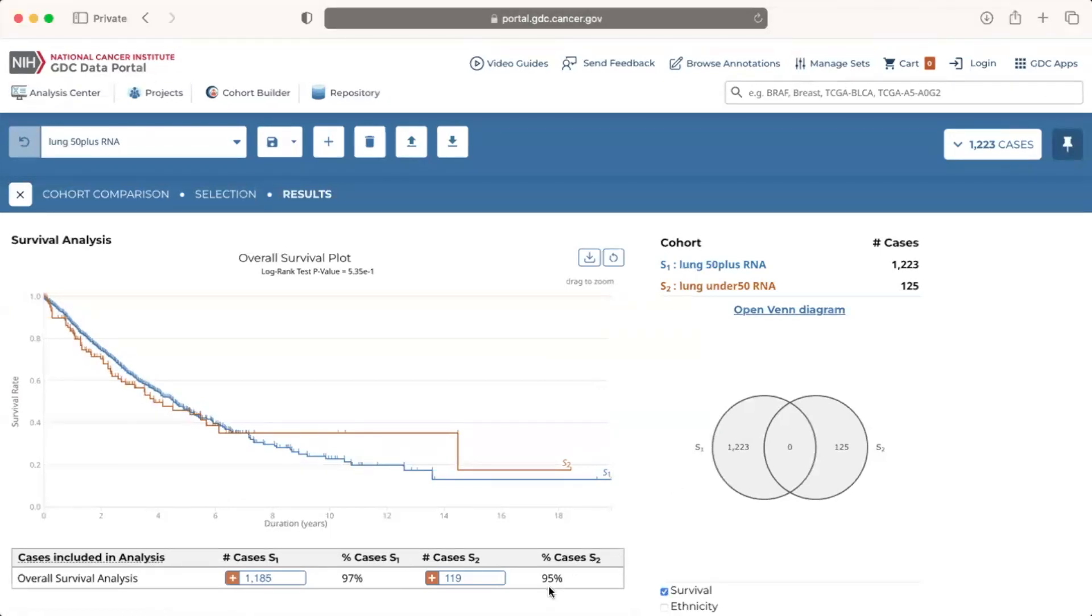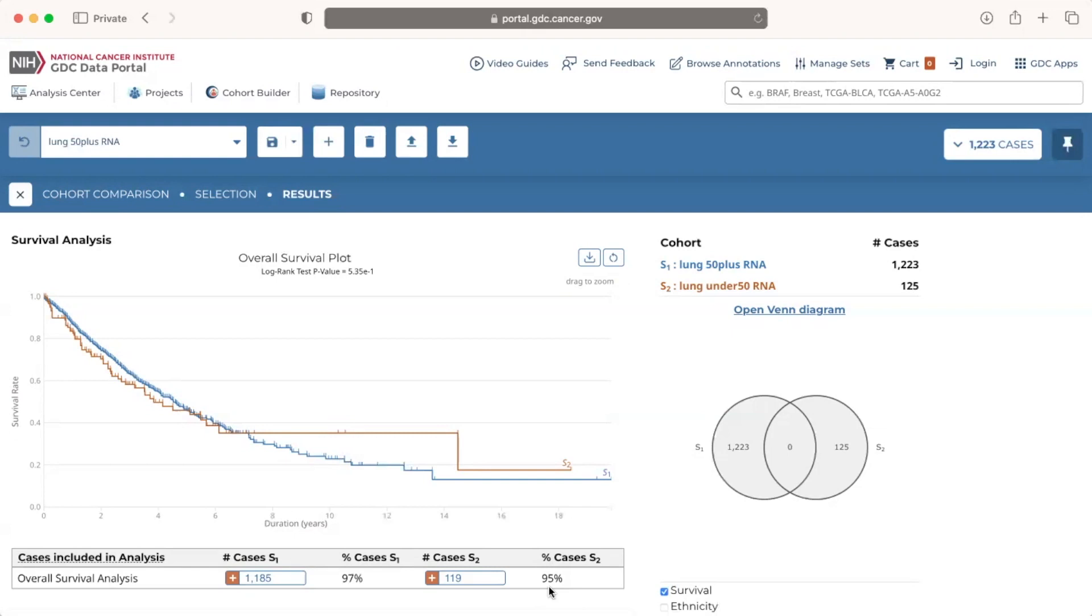For a case to be included in the analysis, it must meet two criteria. One, the case is only in one of the cohorts, not both, and two, the case has the required data for the analysis. Since there are no cases in both cohorts, we can deduce that the 44 cases that were excluded from the survival analysis do not have the required data.